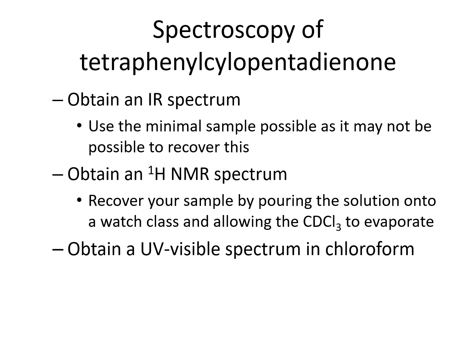As usual, we'll do a spectroscopic study for our product using IR and NMR, and because our product is also a complex compound containing aromatic structures, it's also good to do UV-visible for the structure in chloroform as a solvent.